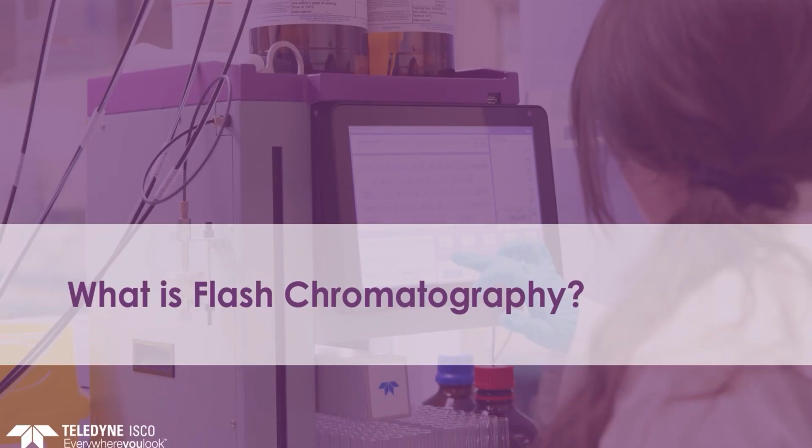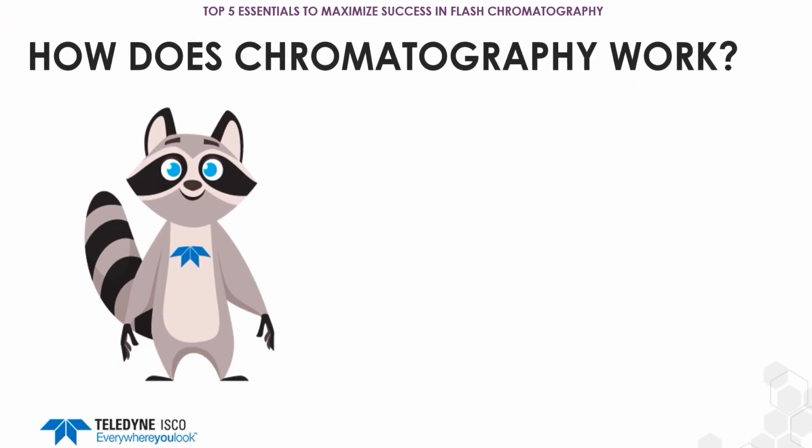So what is Flash chromatography? Before we can answer the question of what Flash chromatography is, first we need to understand how chromatography works. So with that, I'm going to get a little bit of help from our Teledyne ISCO chromatography mascot, Reddy the Raccoon. So you're going to see a lot of Reddy throughout today's webinar. But what is chromatography? Well, in simple terms, chromatography is just the process used to separate different components of a mixture. A lot of time this is going to be a couple different compounds, but it could also just be A and B, and you want to get the best separation between those two as possible.